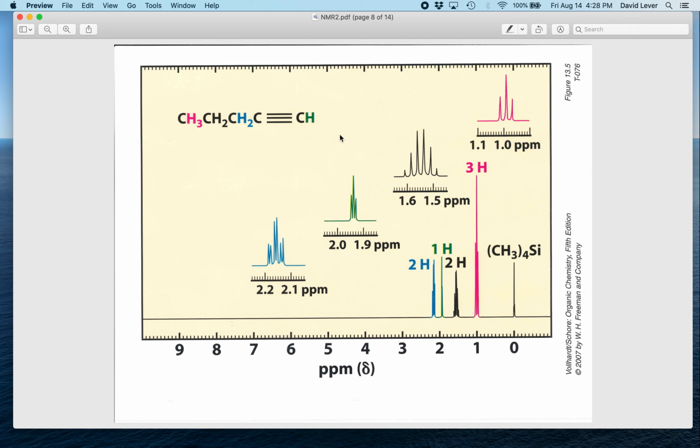Alkynes are interesting because the CH peak on the alkyne is not as far downfield, because remember the alkyne orients itself parallel to the applied field rather than perpendicular. The hydrogen doesn't have any hydrogens on the adjacent carbon, yet it's still split into a triplet. That is a 1,3 coupling. That's a long-range coupling, and that's typically similar to the geminal coupling in an alkene, at about 1 to 3 hertz. So we've got a triplet with a very small coupling constant.